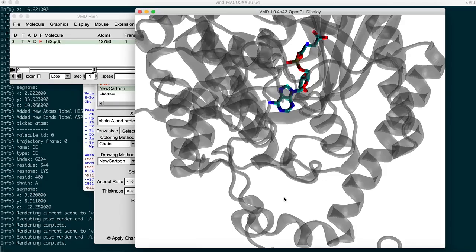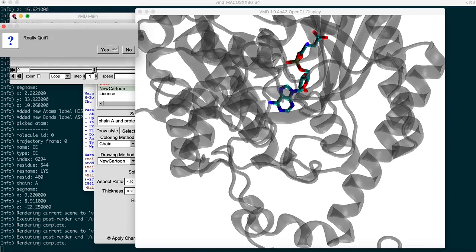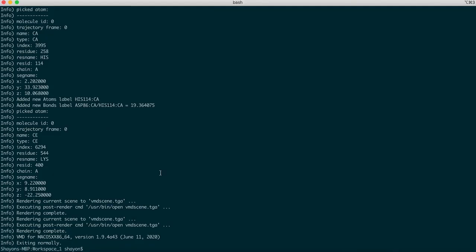So finally, as decided, we'll go back to opening the structure that we have just saved, the chain A portion of it, which contains the aspartyl tRNA synthetase bound to AMO, which is aspartyl adenosine 5' monophosphate. We'll go back to the text edit mode. You can use your notepad to open it. So I'm just going to close this here. I'm quitting VMD. When you press on the cross here, it will ask you really quit. You say yes, and it's gone. It took a while because of the capabilities of RAM and stuff like that.